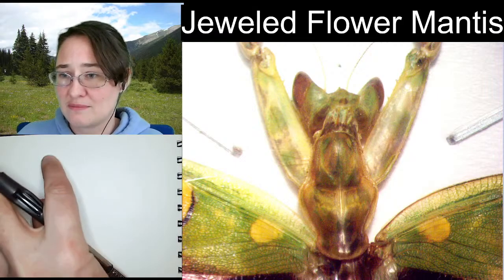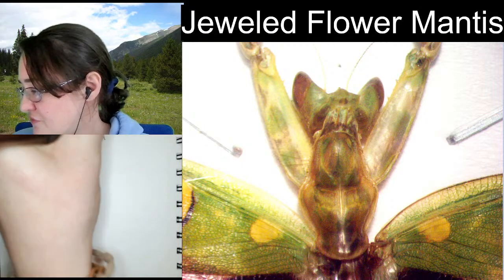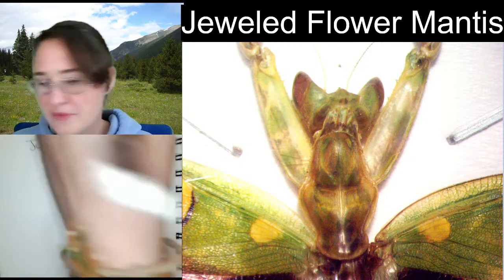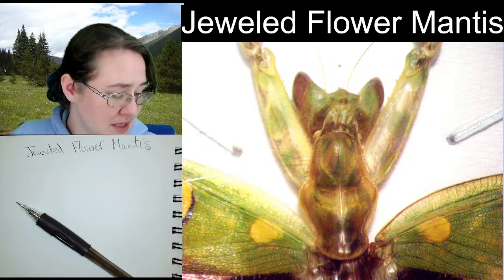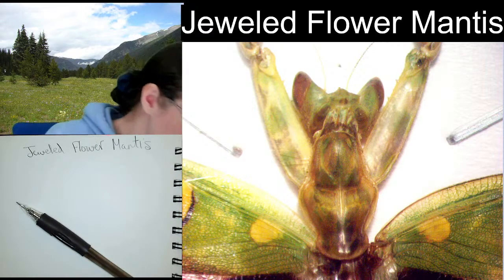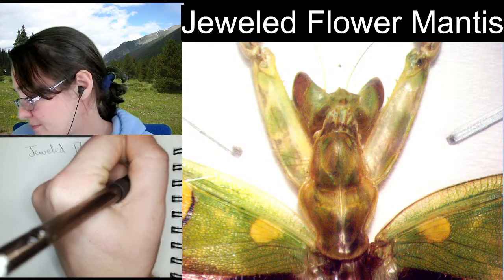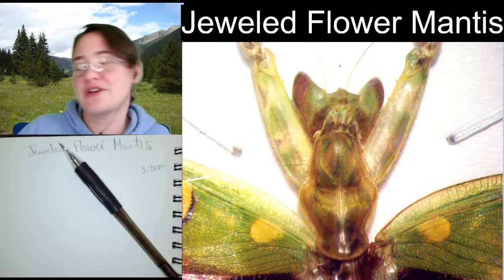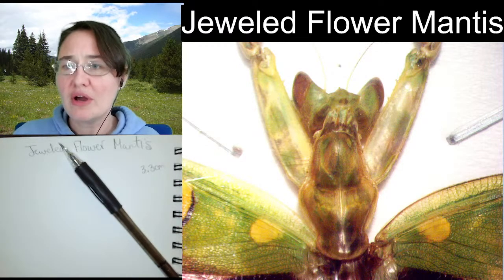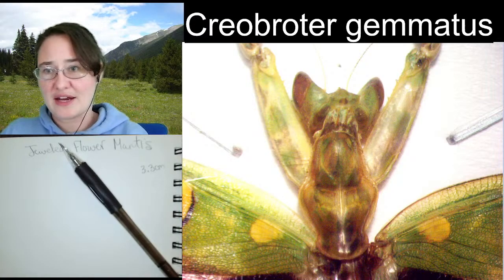So I'm going to go ahead and put up here, jeweled flower mantis. Now, this specimen, you can see the name up there. I can measure it right now, it is about 3.3 centimeters from the front of the head to the back of the abdomen. I'm personally curious what the inches on that is. It's about an inch and a half long. Okay. So, the scientific name on this mantis is Creobroter gemmatus. We've got it right there.